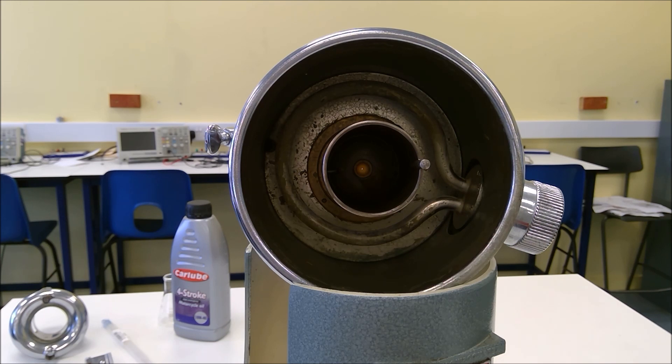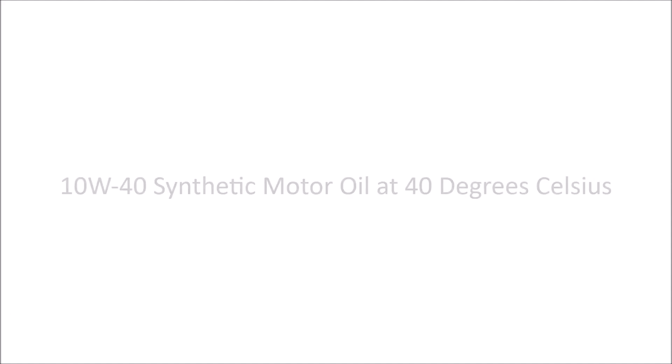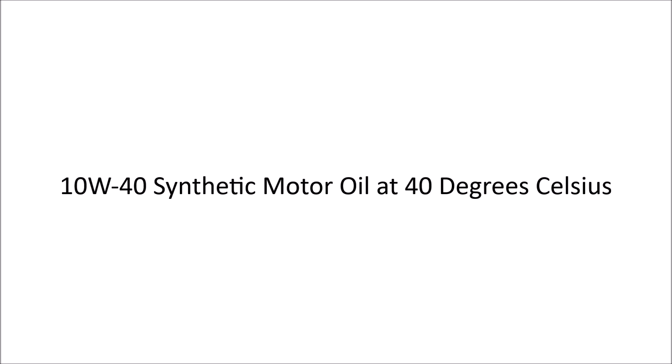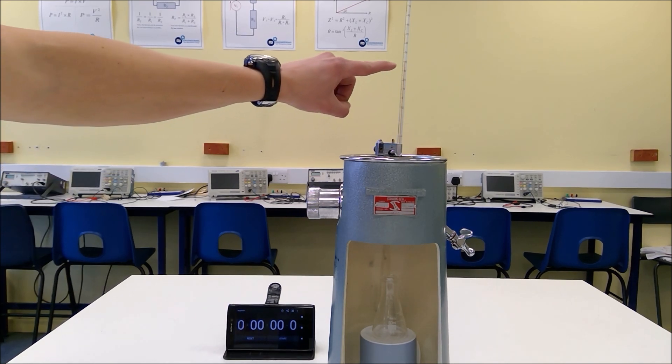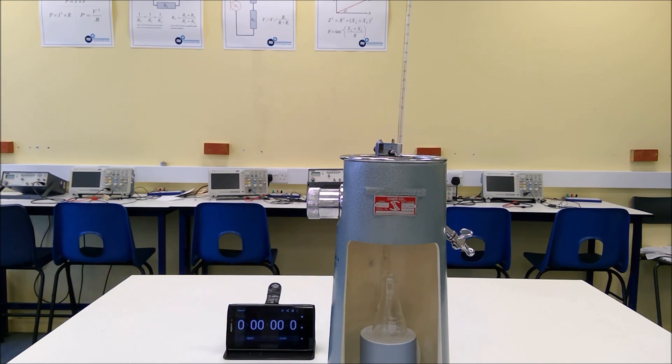So now I'm going to set up the Redwood viscometer for our first viscosity measurement. In this first experiment we can see that the temperature of the oil in the vessel is at 40 degrees. I'm going to lift the plug that's covering the orifice and then we're going to time how long it takes to collect 50 millilitres of the oil.